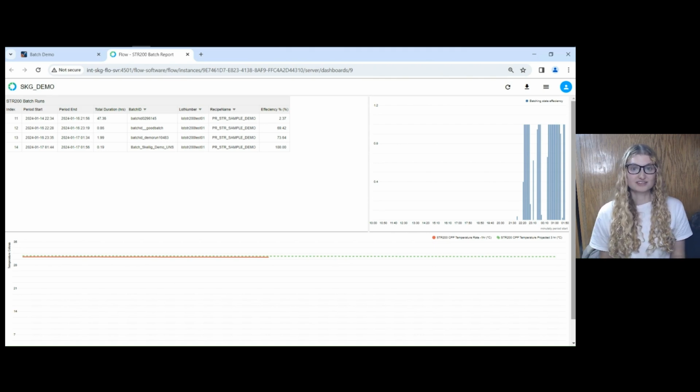What's wild is during my entire process automation control career, I have never seen a screen for efficiency, let alone full-on OEE. It probably existed somewhere. Maybe it was on the to-do list for the MES group, but since OEE isn't on the FDA's pre-requirement list to validate your process, who knows if they had time to get to it.